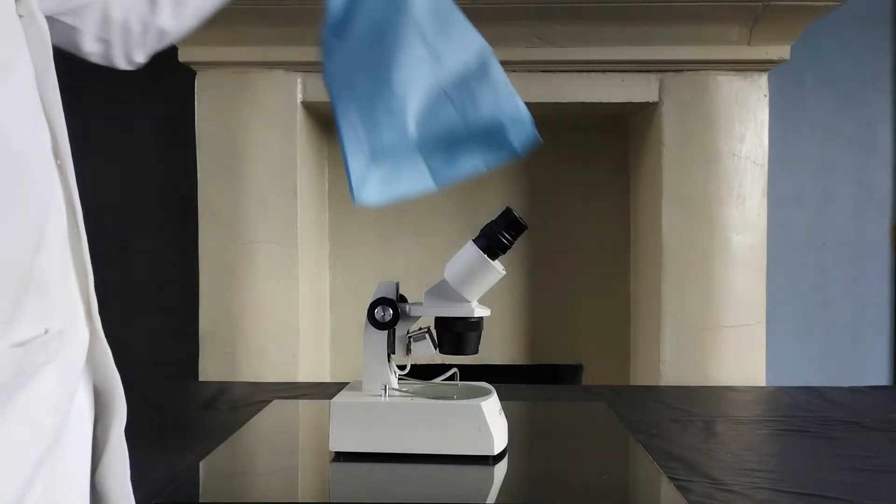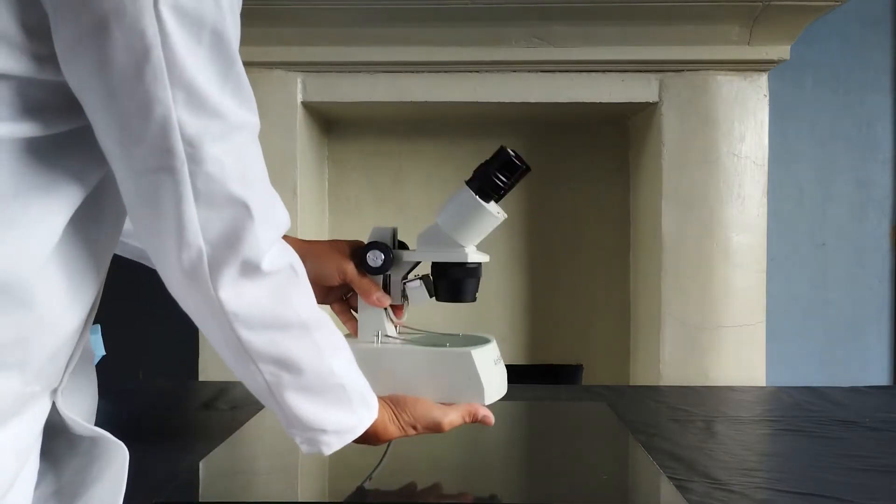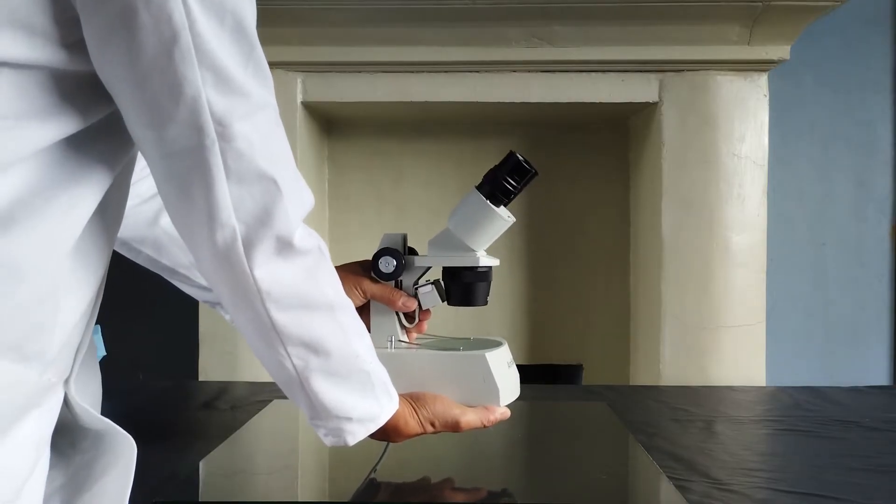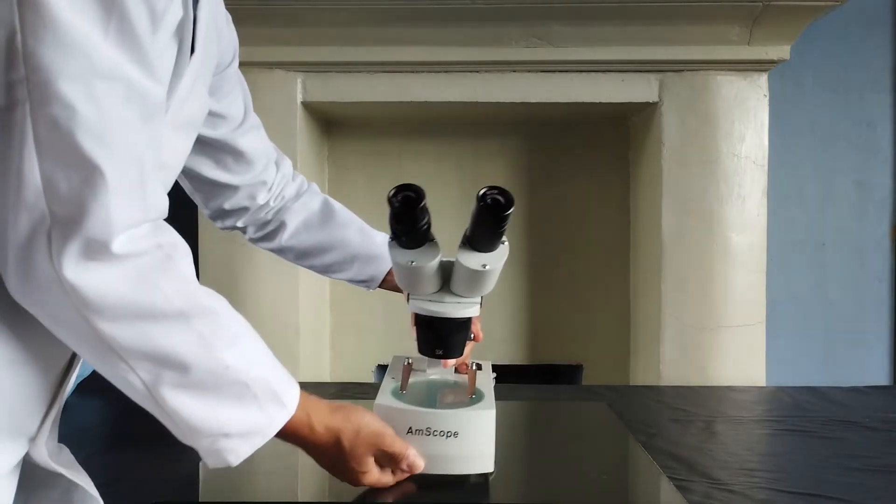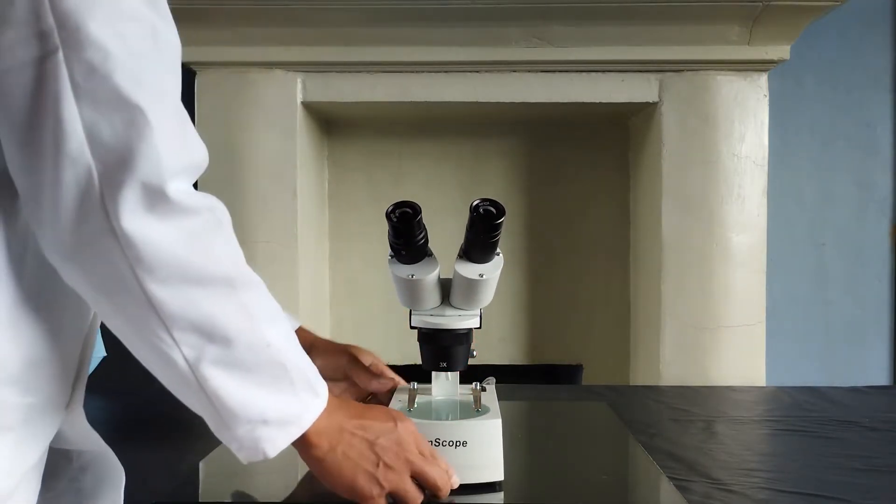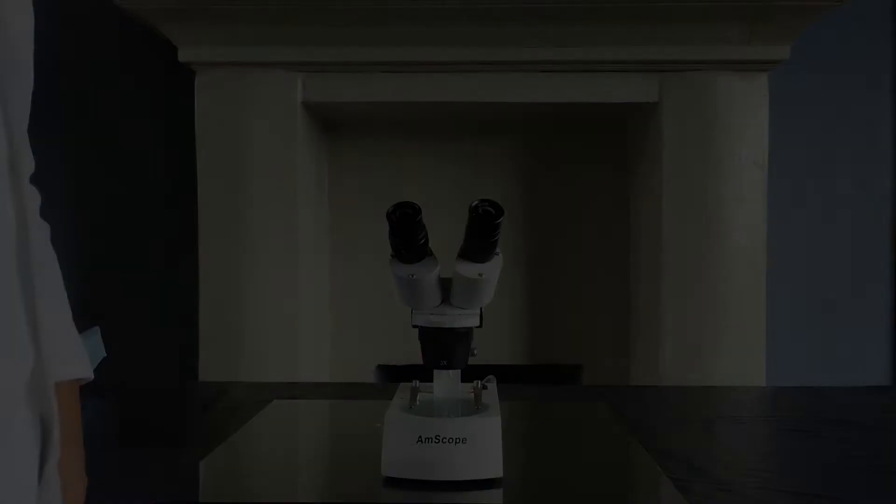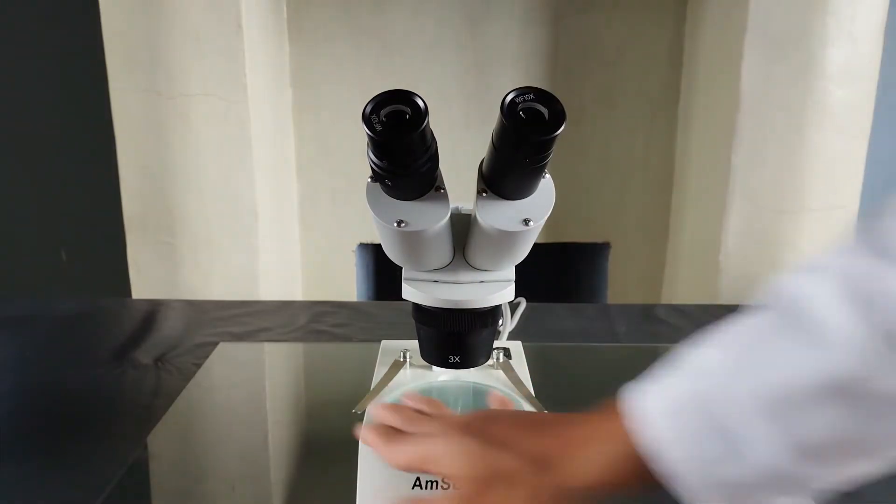Once you remove the Stereo Microscope from its box, bring it to the working table by holding it with both hands, one hand firmly holding the arm of the microscope and the other hand supporting the base of the microscope like so. Safely position the microscope on the table and make sure that the base of the microscope is at least 3 inches away from the edge of the working table. Clean the eyepiece lenses and the stage with lens cloth or lens paper.